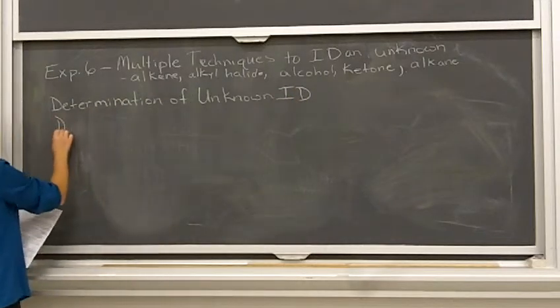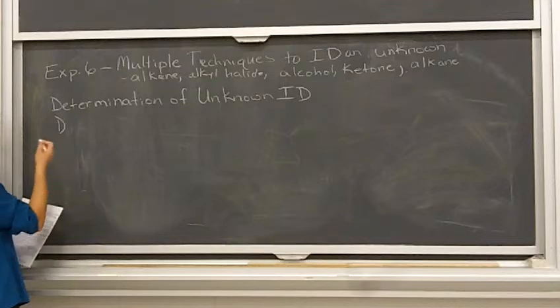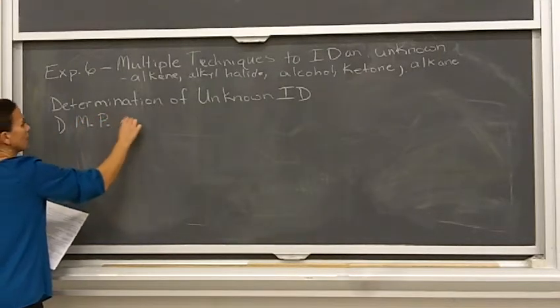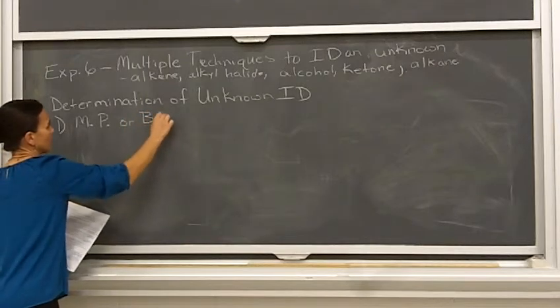So one of the first ones is, depending on if it's a liquid or a solid, we will be collecting a melting point or a boiling point.